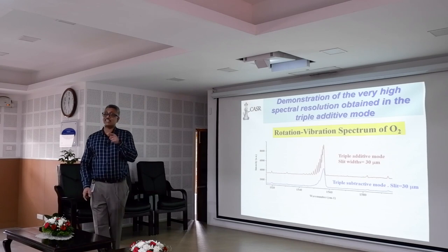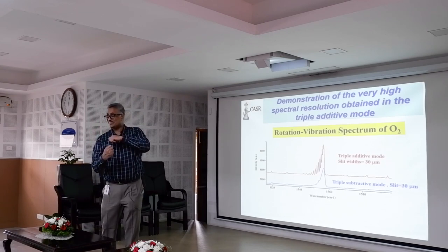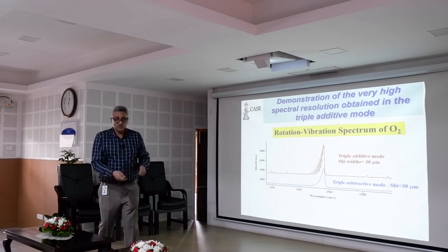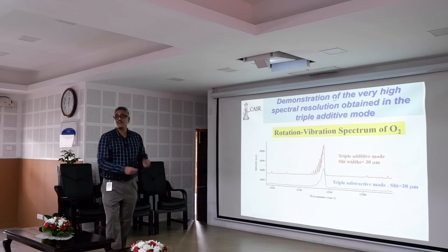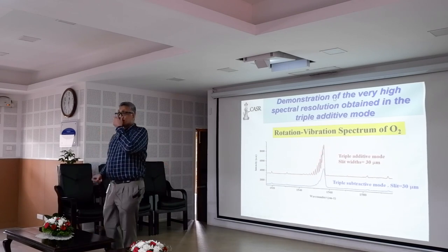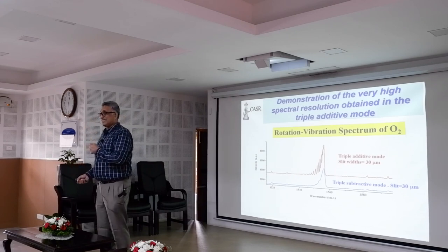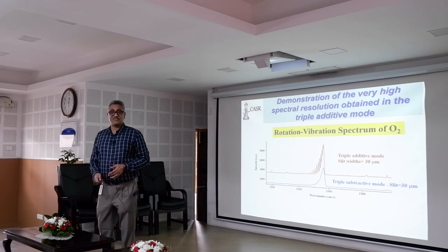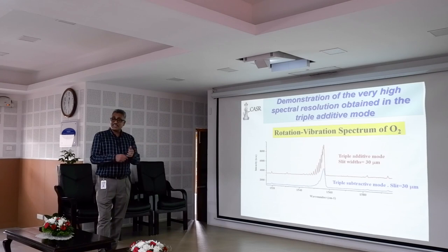But I also told there is rotational Raman. The oxygen can rotate, right? So the rotation has energy. It is coupled with the vibration. You see the rotational Raman of the vibration. See the beautiful rotational Raman. So if I have a better resolution, I can even see very closely spaced lines in a Raman to see this rotational Raman.